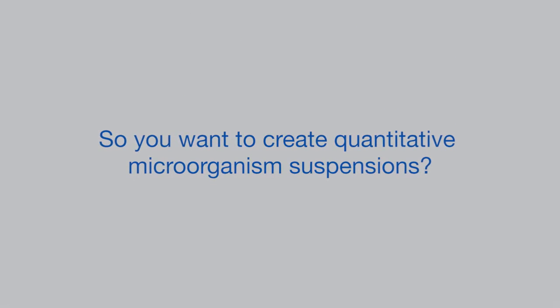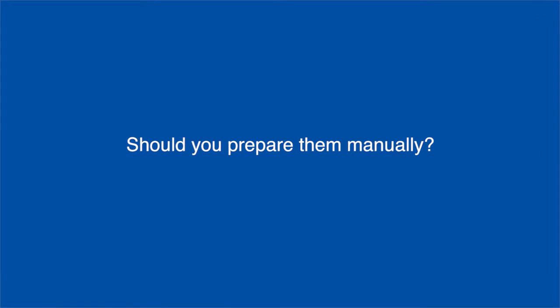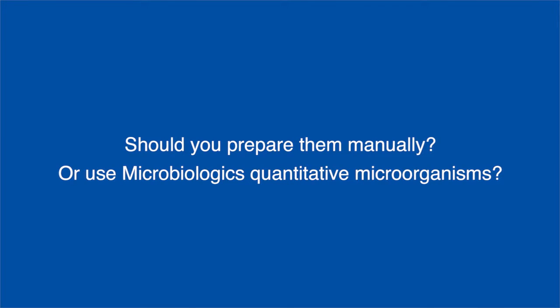So you want to create quantitative microorganism suspensions? Should you prepare them manually or use Microbiologics quantitative microorganisms? Let's take a look at both. First, let's manually create quantitative suspensions.